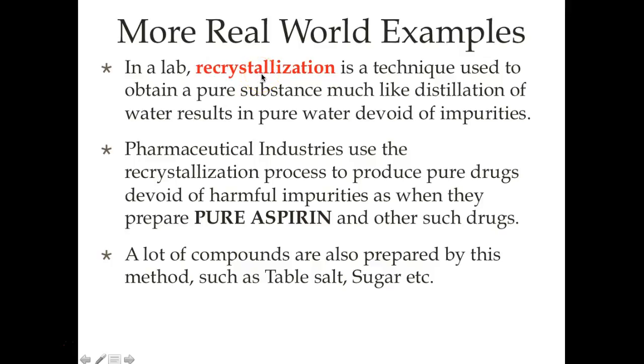The reason for that is, suppose you took some impure substance, the substance that you desired from your lab experiment, but you wanted to increase its purity, all right? So initially, the substance you procured from your experiment had other impurities in it.